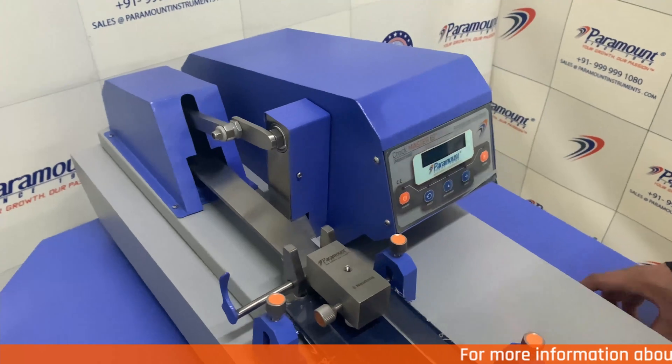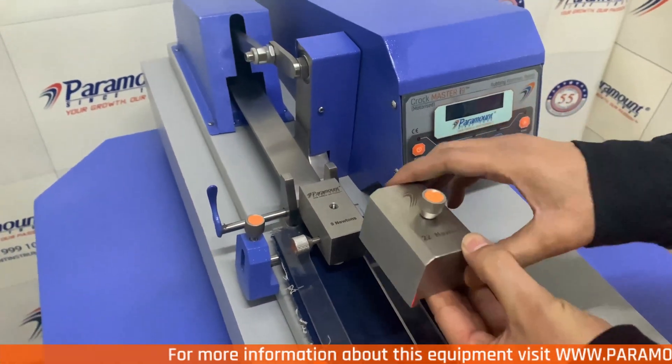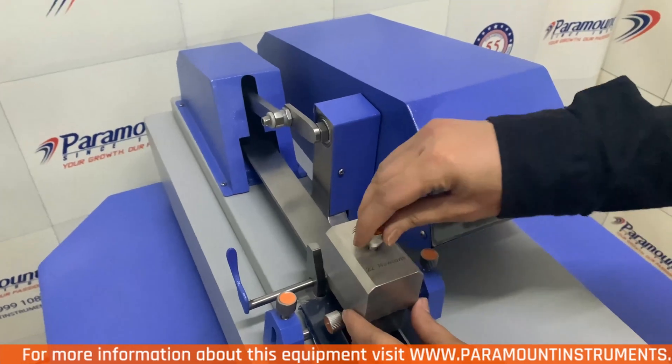For heavy fabrics, we have the additional weight of 22 Newtons which is provided with the equipment. This is to get the most accurate and reliable results.